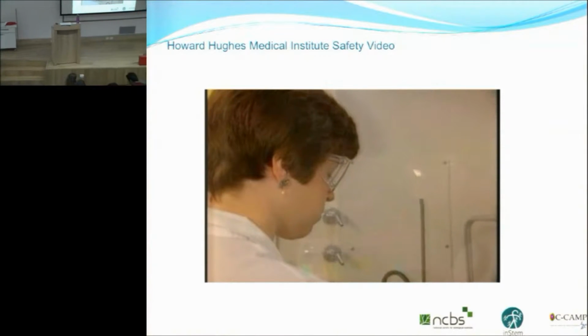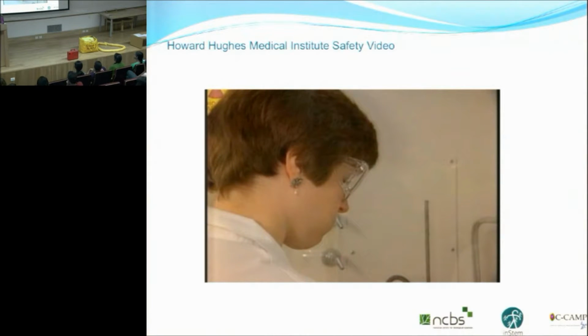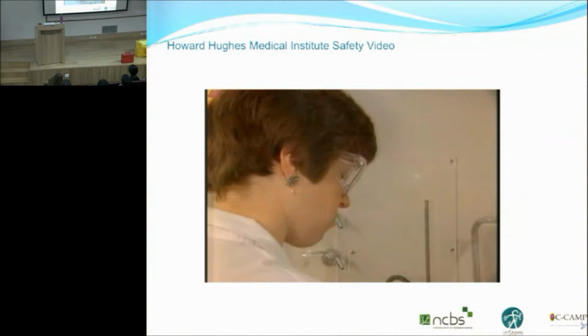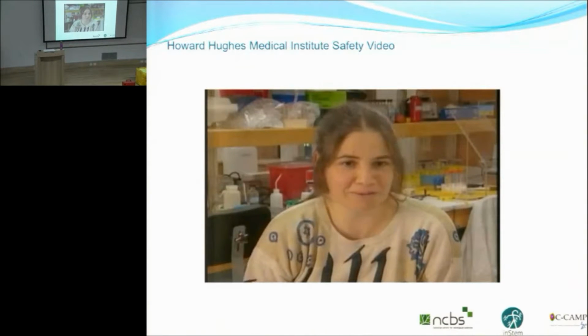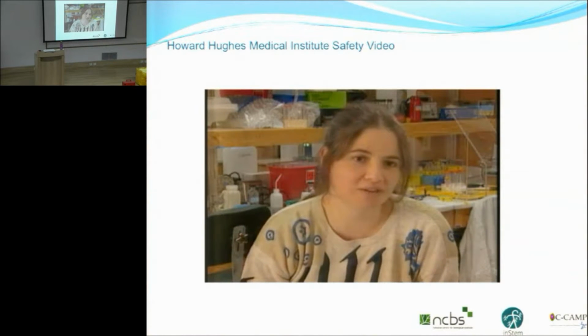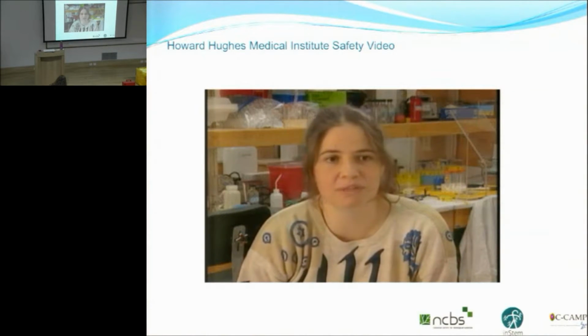Maintain concentration. There is clearly a danger that just by habit one will forget and become less and less careful. The other thing is that people should not work in the lab when they are exhausted. I love having people working late at night. That means they are really interested in what they are doing. But on the other hand, one reaches a point where one is just too tired to do an experiment properly. That is bad for safety, and that is also bad for the experiment.